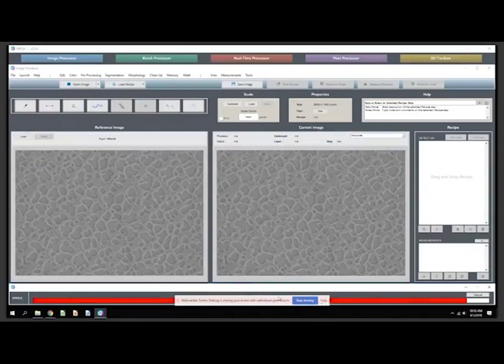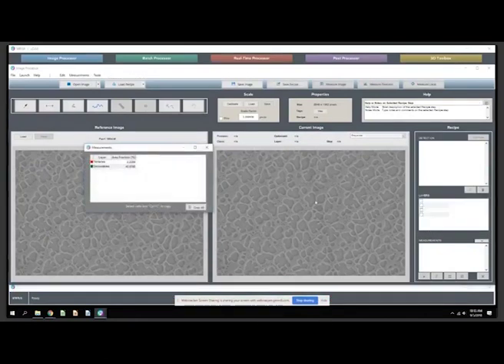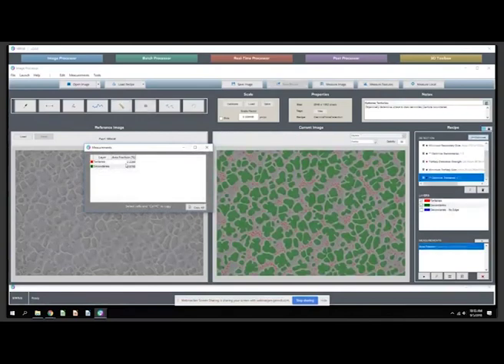And when it's done, not only will it present to you the detection results, but you also get a report of all of the measurements that have been baked into the recipe. This is just simple volume fraction measurement here, so-called global measurements, things that result in one image or one measurement per feature type. You'll see we can build on this report and make it as comprehensive as we'd like and still have it baked into the recipe executable with one drag.